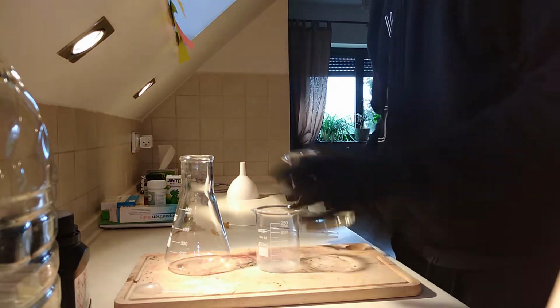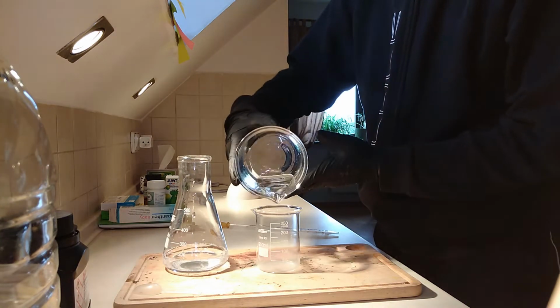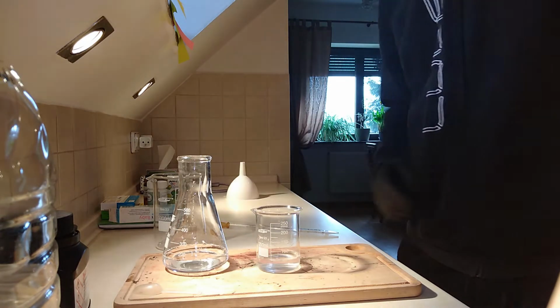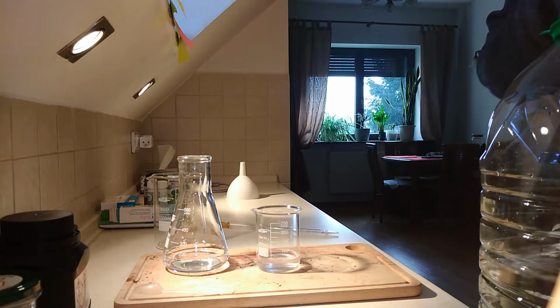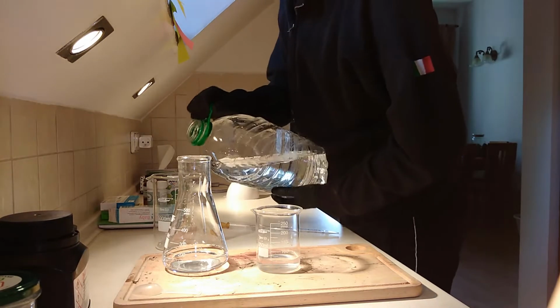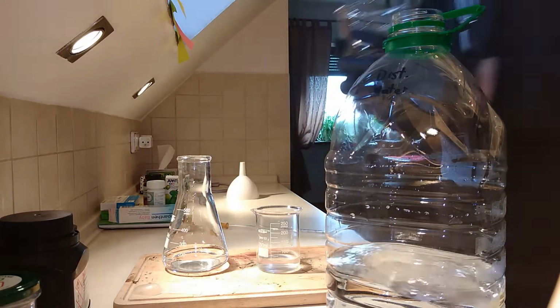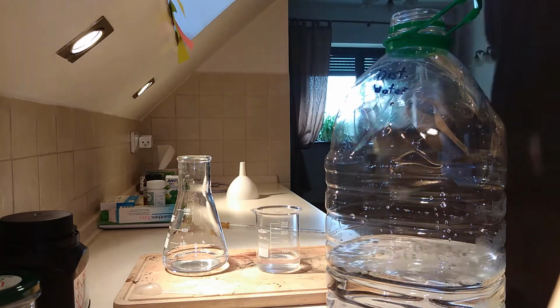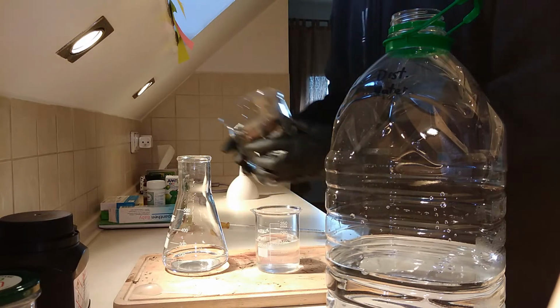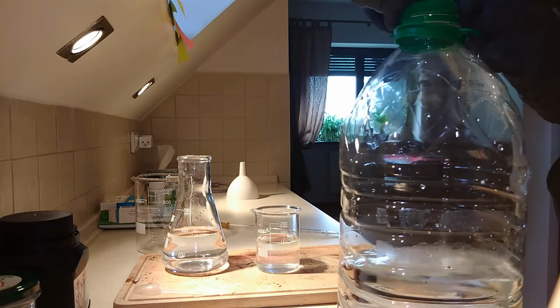So first I will make the permanganate solution. It has to be really dilute, and obviously here, water. Now I will maybe add more water. This is not enough for the sodium hydroxide and the manganate too. So, whoa, this is too much. Right now, prepare that you'll be watching me pour water in and out of the beaker. Alright, so now there's enough water for the reaction everywhere.